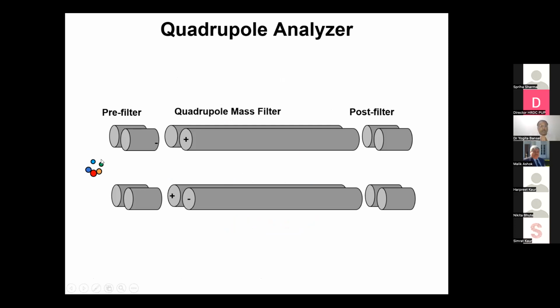When a charged particle moves through an electric field, it is deflected. This is the basis of mass spectrometry, as in the cathode tube we have seen. So it has to pass through it, and it has to travel in such a way that it does not strike the poles, but oscillates with the same frequency at which this field is oscillating.